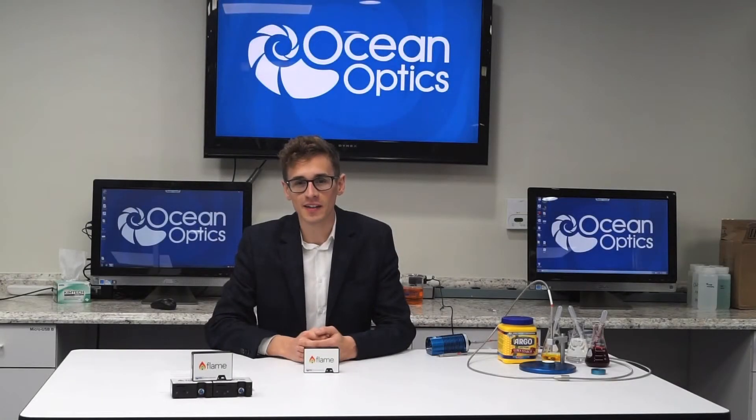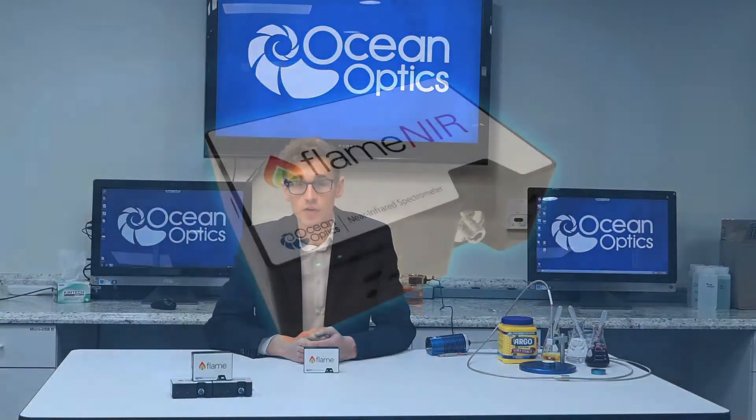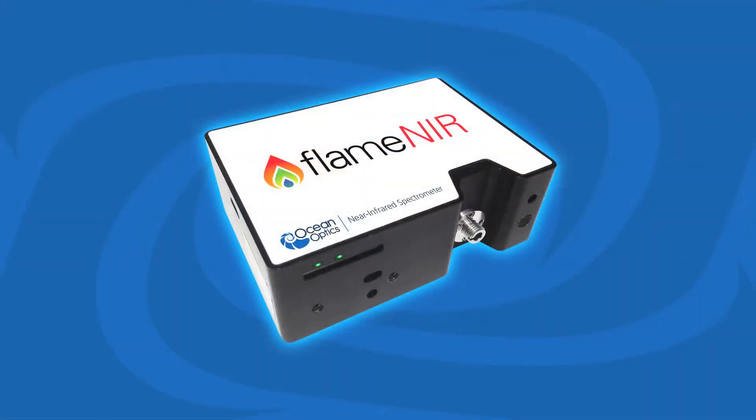Hello, I'm Henry Langston, Product Manager at OceanOptics. Today I'd like to introduce you to the new Flame-NIR, our smallest and best value NIR spectrometer ever.